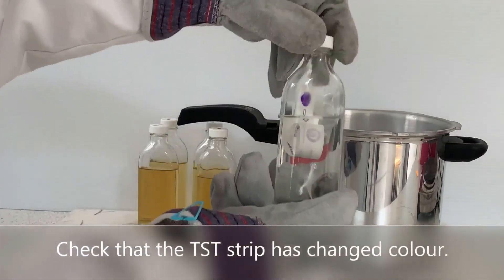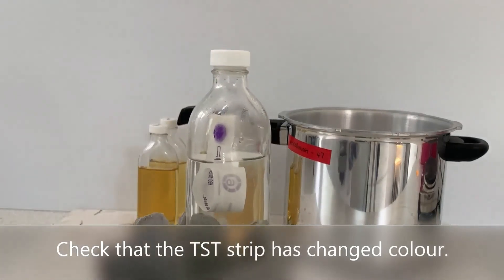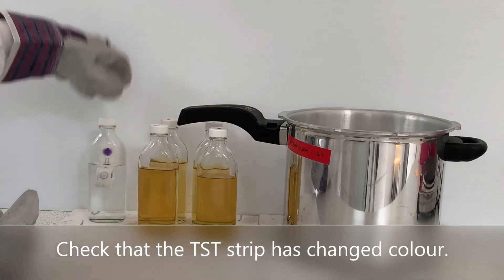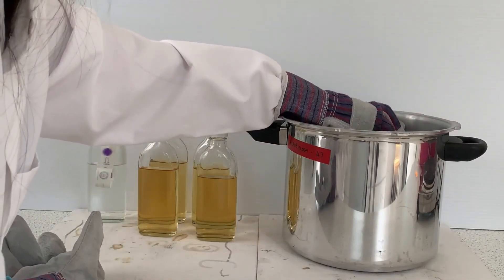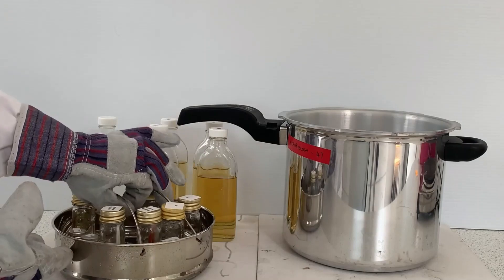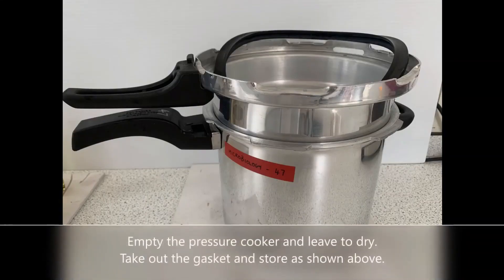Check that the TST strip has changed colour. Remove the basket. Empty the pressure cooker and leave to dry. Take out the gasket and store as shown above.